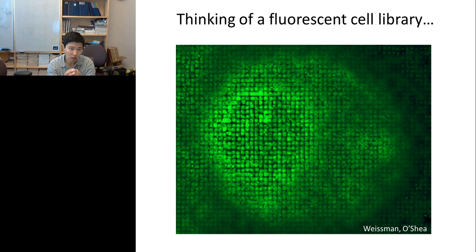Usually people think of fluorescent microscopy as something where you know what to look at, then you can label it with a GFP, look at it, identify where it's coming from, and analyze the behavior of the target protein. But once you have this library, fluorescent microscopy becomes a very powerful primary discovery tool because you don't have to take up a hypothesis.